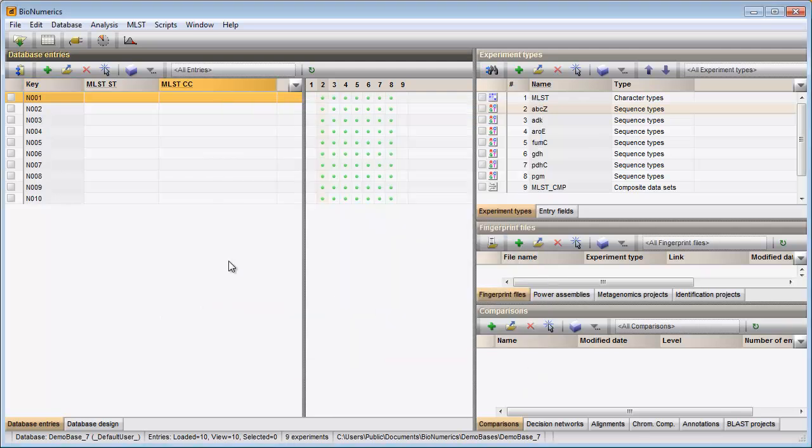Screening can be done for all entries present in the database or for any selection of entries. I will select all entries using the keyboard shortcut Ctrl-A.